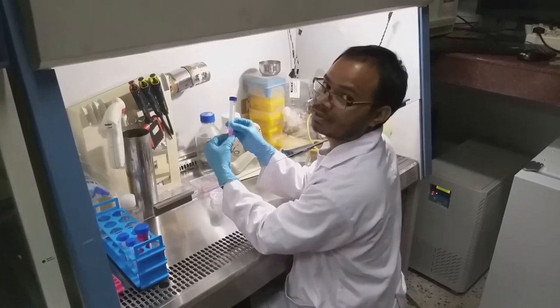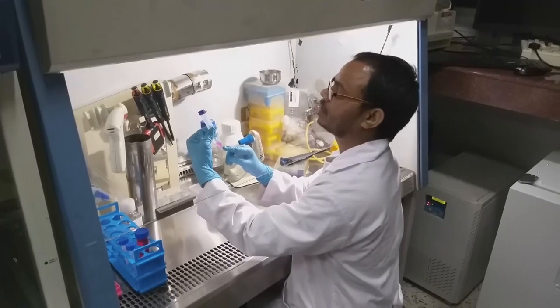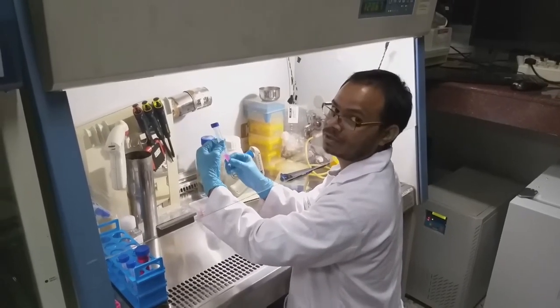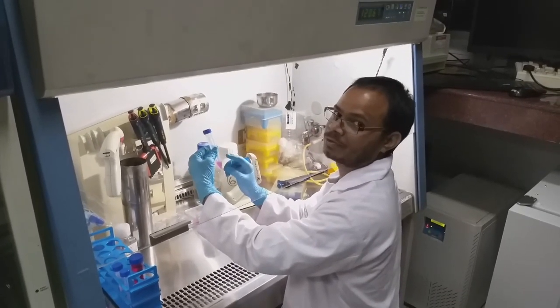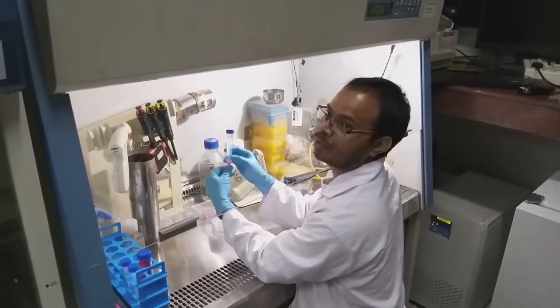After resuspension, we have to count the cells. So I am going to take 20 microliter of this cell suspension and mix with 20 microliter of trypan blue and count under Neubauer chamber.